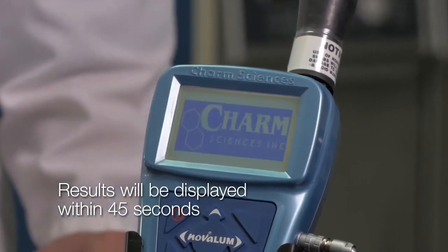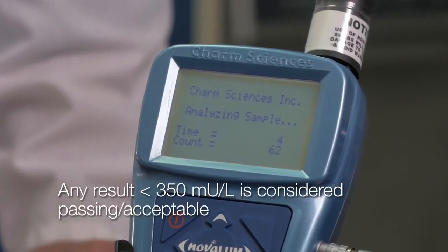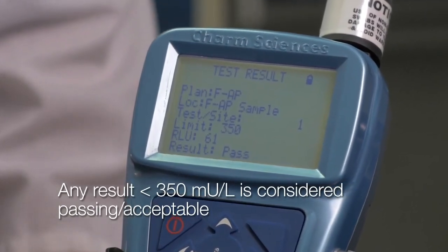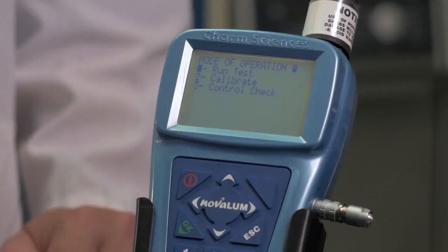For the FAP milk test running in this demonstration, any result less than 350 mU per liter will be defined by the Novolume as a passing result. Here, the milk sample shows a passing result of 61 mU per liter. Press OK to clear the Test Results screen and return to the Run Sample screen.